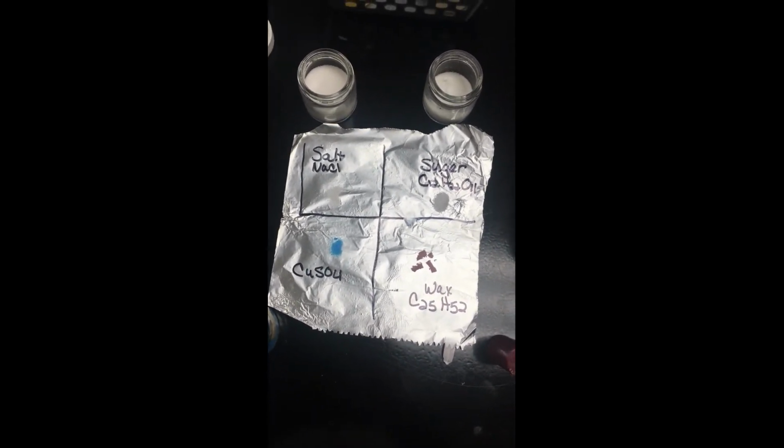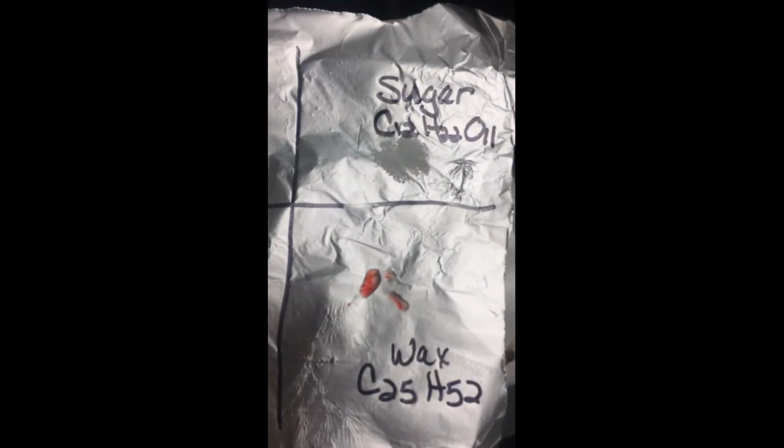So our first property that we're going to look at is melting point, and we took in our notes that ionic compounds have very high melting points and covalent compounds have lower melting points. So we're going to put this on a hot plate and see what happens. So right away you can see that candle wax is melted very quickly. Okay, now let's see about our other compounds.